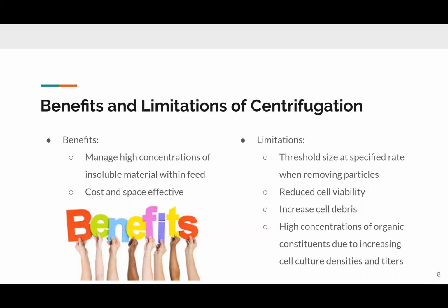The benefits of centrifugation include managing high concentrations of insoluble material within the feed, cost and space effectiveness, while the limitations are the threshold size at a specified rate when removing particles, and that there's reduced cell viability and an increase in cell debris.